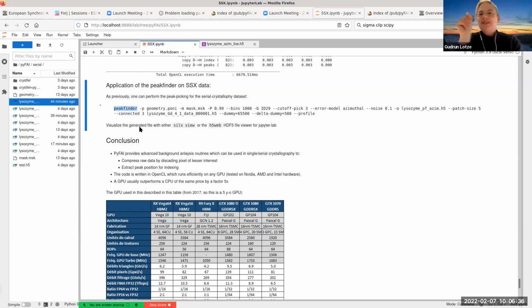I'm sorry. Okay, so I'm scanning with the X-ray beam over my sample, and it has a diffraction signal. And then I would somehow like to follow those peaks, to see if they belong together, as I move the X-ray beam further. That's a problem of isomorphism. You want to check if it's the same crystal. Yes, maybe. I'm not such an expert in diffraction, sorry. I'm just learning.